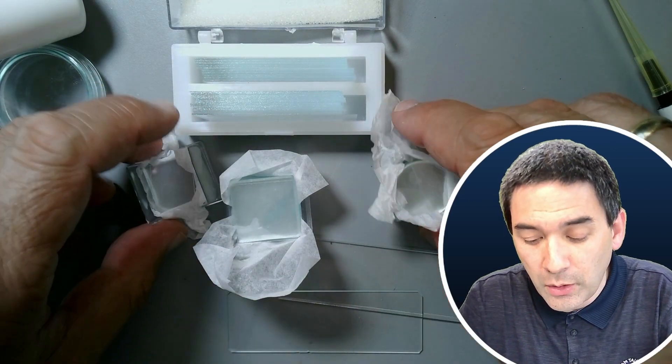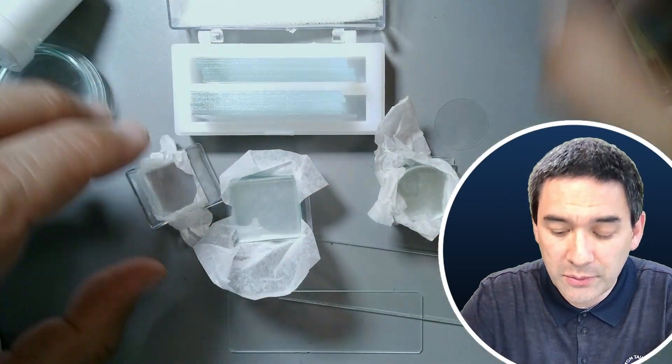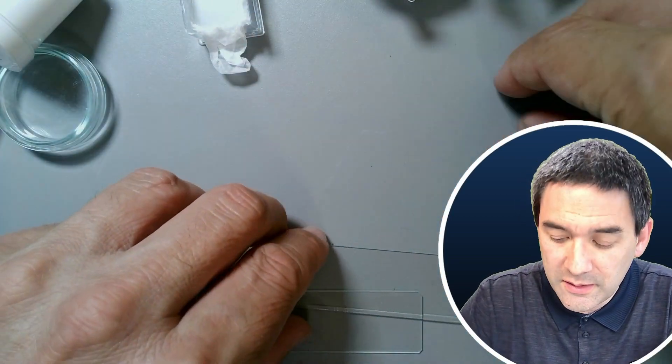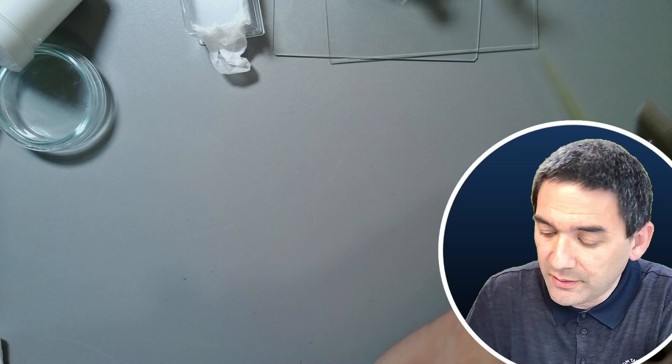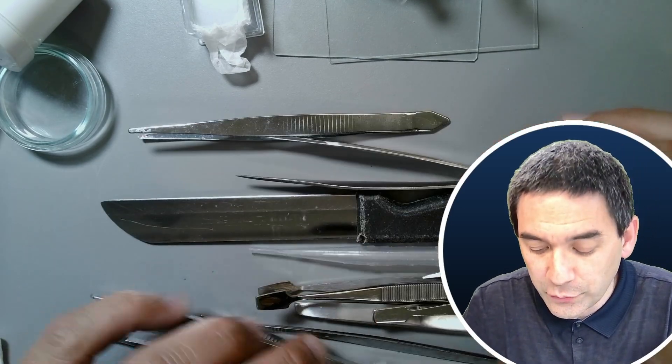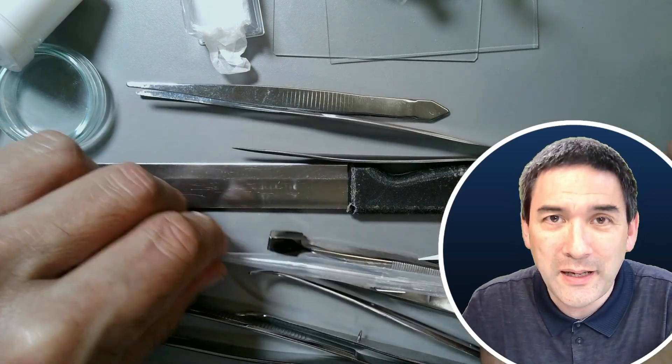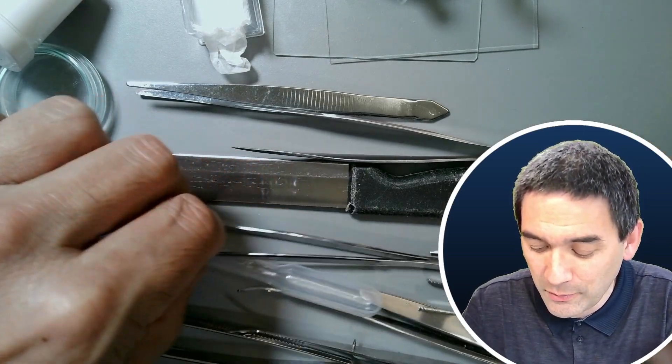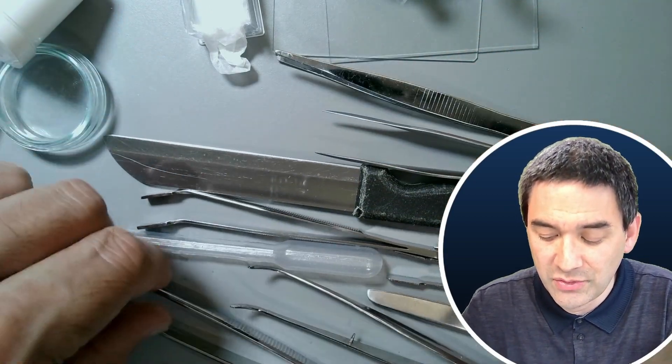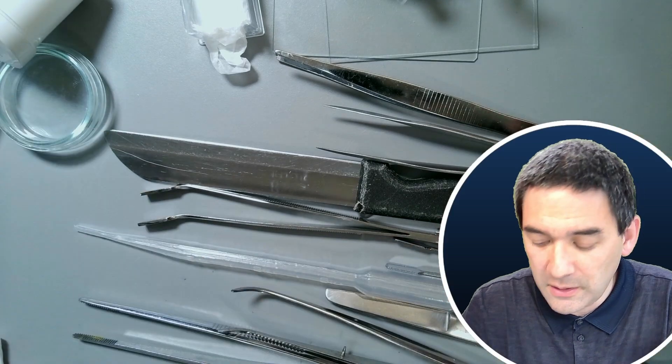Now let's move on to some of the tools. This is an extensive selection of tools. The good news is you do not need all of those. I've simply accumulated some over the years. I've got a whole assortment of different types of tweezers and two different kinds of scissors. This is a pipette.